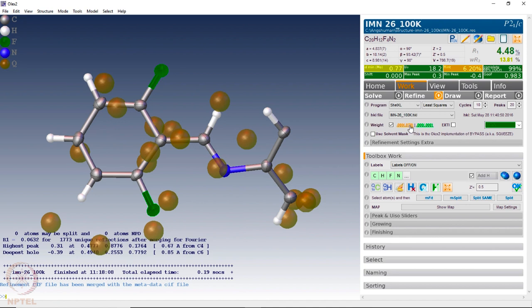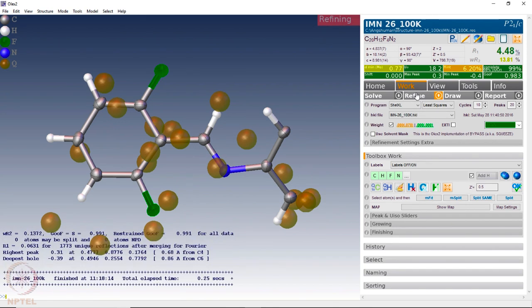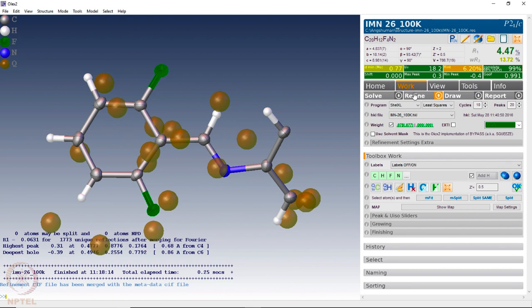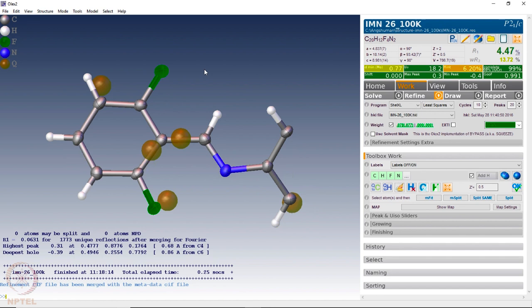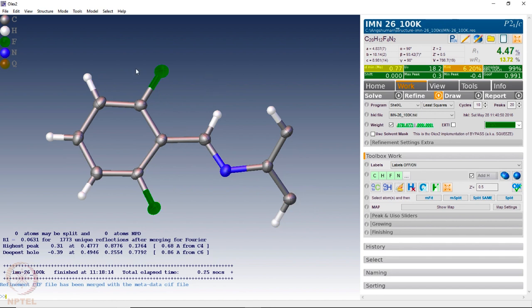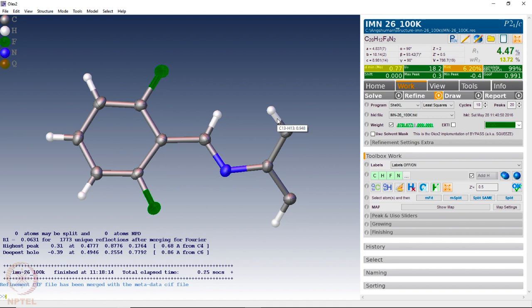All the weighing parameters should become green, indicating that the refinement is reaching convergence. At this point we remove all other residual densities. Bringing the cursor to the carbon-hydrogen bond shows the distance. The distances observed are: 0.973, 0.948, 0.922, 0.935, 0.948, and 1.009 angstroms for the various C-H bonds.